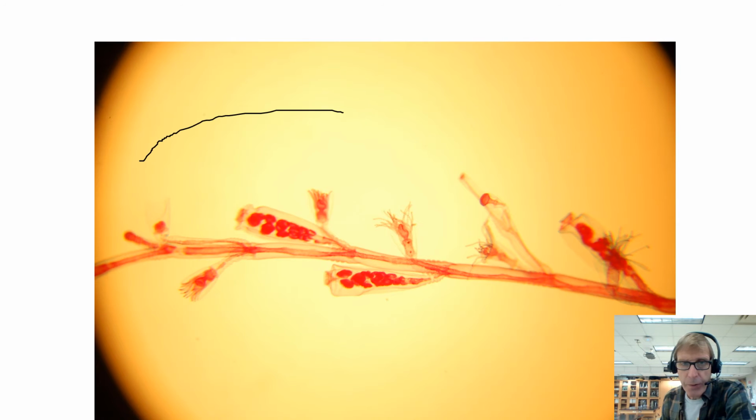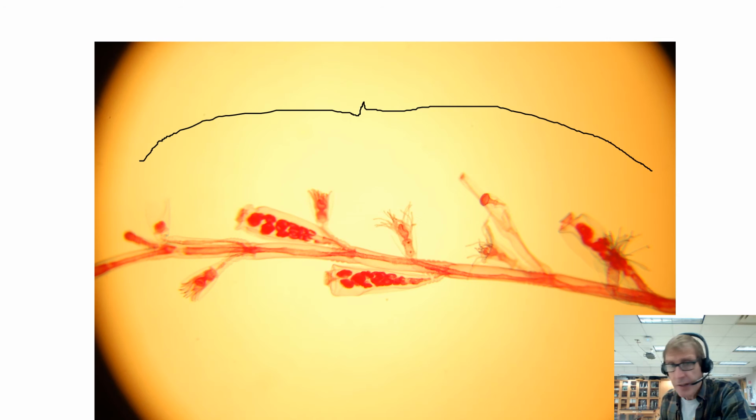All right, this whole thing, it is in the phylum Cnidaria. This is a hydrozoan. What you're seeing here is a colonial polyp, sort of upside down. This would be where it'd be attached at the base. Down at this end would be the base somewhere, and a bunch of colonial polyps sticking out. Now, what's kind of neat with this one, these polyps that look like a standard polyp have tentacles sticking out. Those are the feeding polyps, gastrozoids, they sometimes call them. They'll capture prey, nematocysts, all of that.